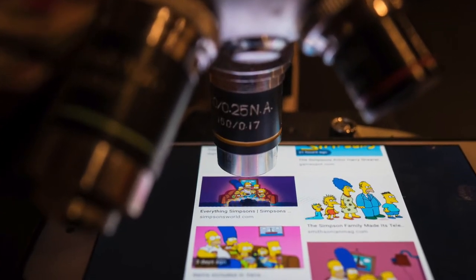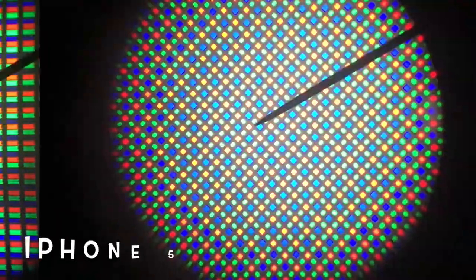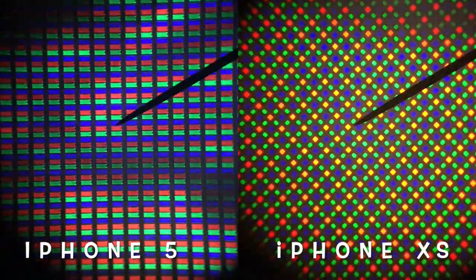I love using the cell phone as an introduction to the microscope. Placing the screen under there really gives some cool images of what a phone is actually made of. Here we're looking at an old phone and a new phone and you can see the evolution of the screen.